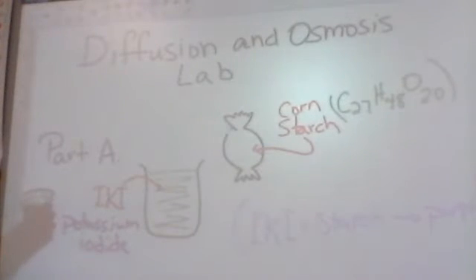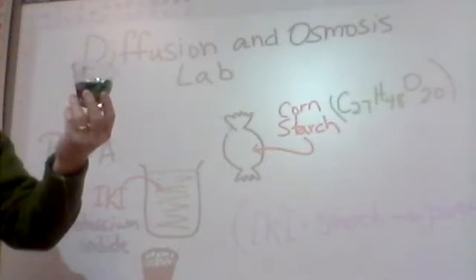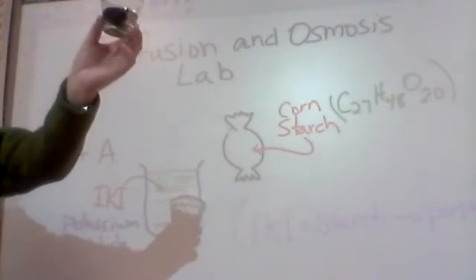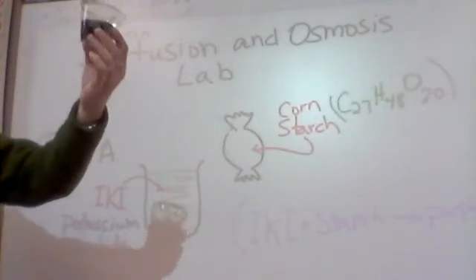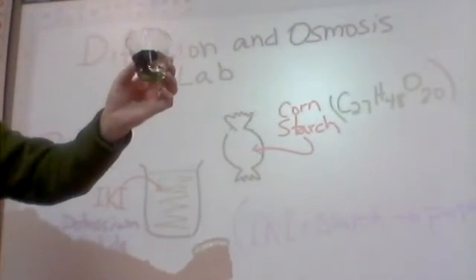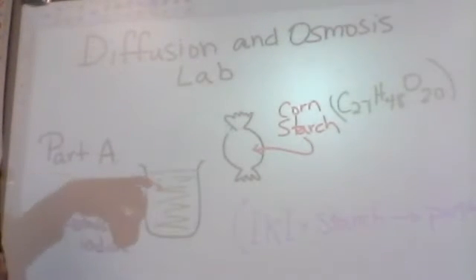Now, why is it not still brown on the outside? Because iodine will disperse and it actually evaporated out. So it moved in, but the rest of it, this still should have some in it. It's not all gonna move into there. It left, but you can tell that there was iodine there because the string is a different color. So this one was the easy one, no measurement involved. You can just see immediately that it was purple. I'll leave this here if you want to take a look at the purple sausage.